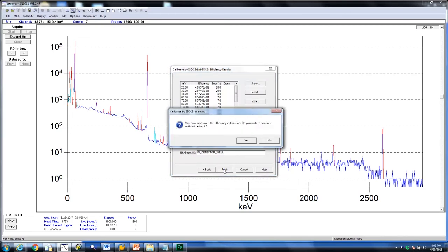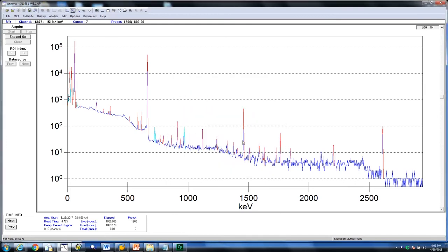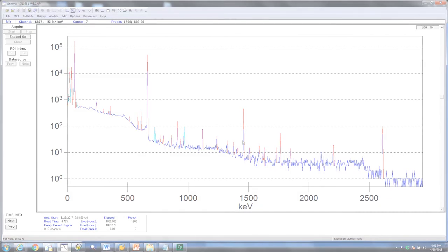If you wanted to, you could save these files as a dot calibration file to use in the future or you can simply continue and apply this calibration for the particular spectrum you are looking at. This spectrum is now calibrated with a LabSox efficiency and is ready to be analyzed.